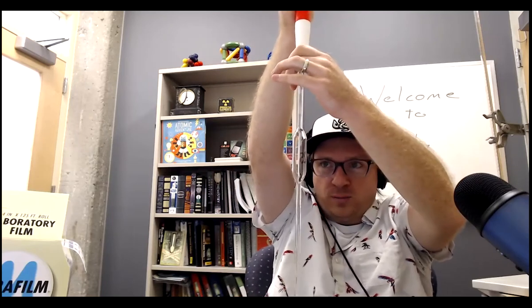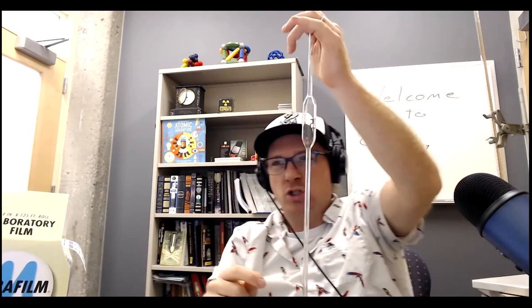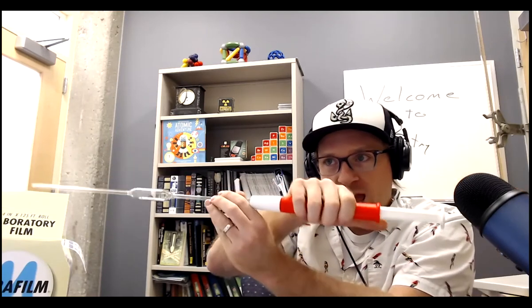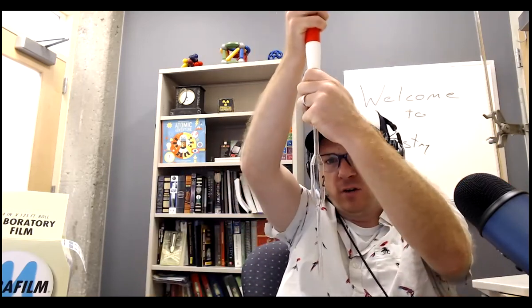Now you put the plunger back in, you pull it up, you pull the liquid. You want to pull the liquid up slightly above. And what you'll notice when you're pulling up on this is it'll go pretty fast through the thin part, and then it'll go really slow through the bulb. And then once it gets to the top here, it'll go fast again. So I've seen people way over crank near the top, and then all of a sudden it shoots up into the pipette aid. You don't want liquid up in the pipette aid. So you've got to be kind of careful here.